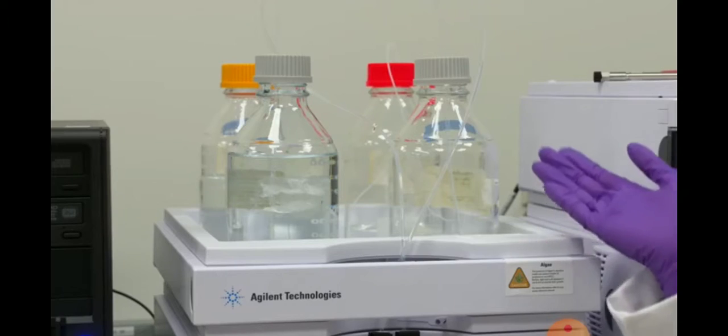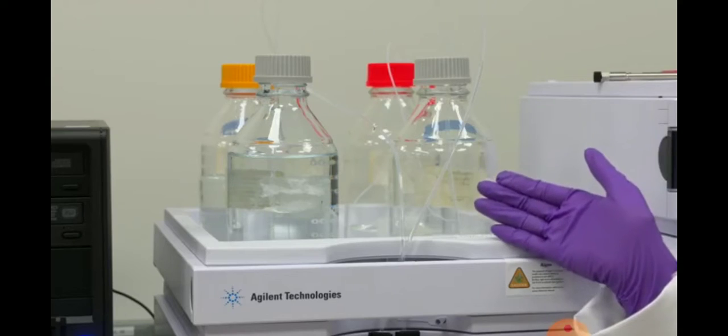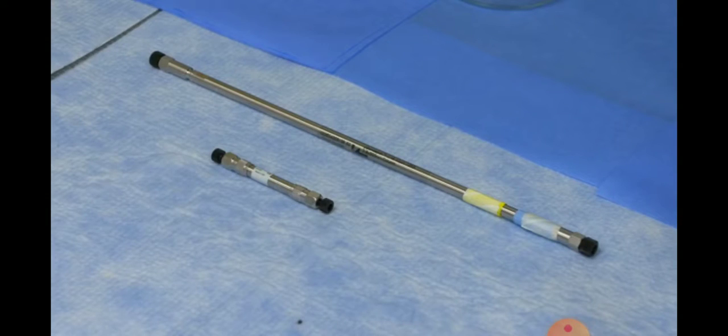To run HPLC, you need mobile phases. Shown here are different kinds of mobile phases. What is a mobile phase? A mobile phase is basically a solution that runs through a stationary phase called a column. These are the two different kinds of column used in HPLC to run your mobile phases through.